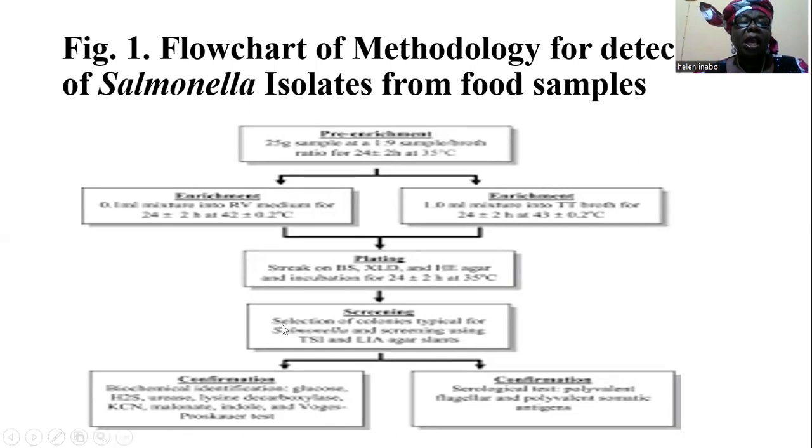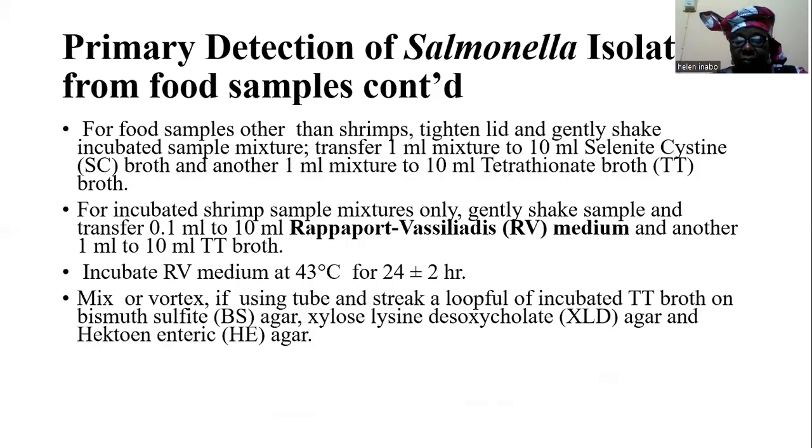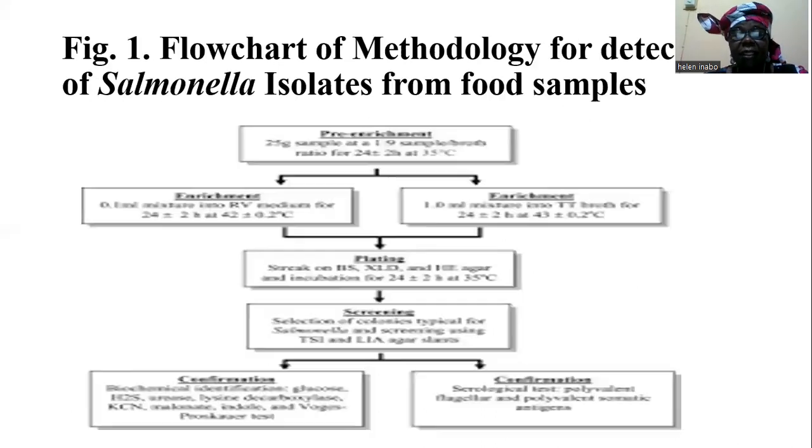Also, here, another tube can be inoculated, and the medium is Rappaport Vassiliadis medium. The same conditions of incubation at 42 degrees Celsius for 24 hours.